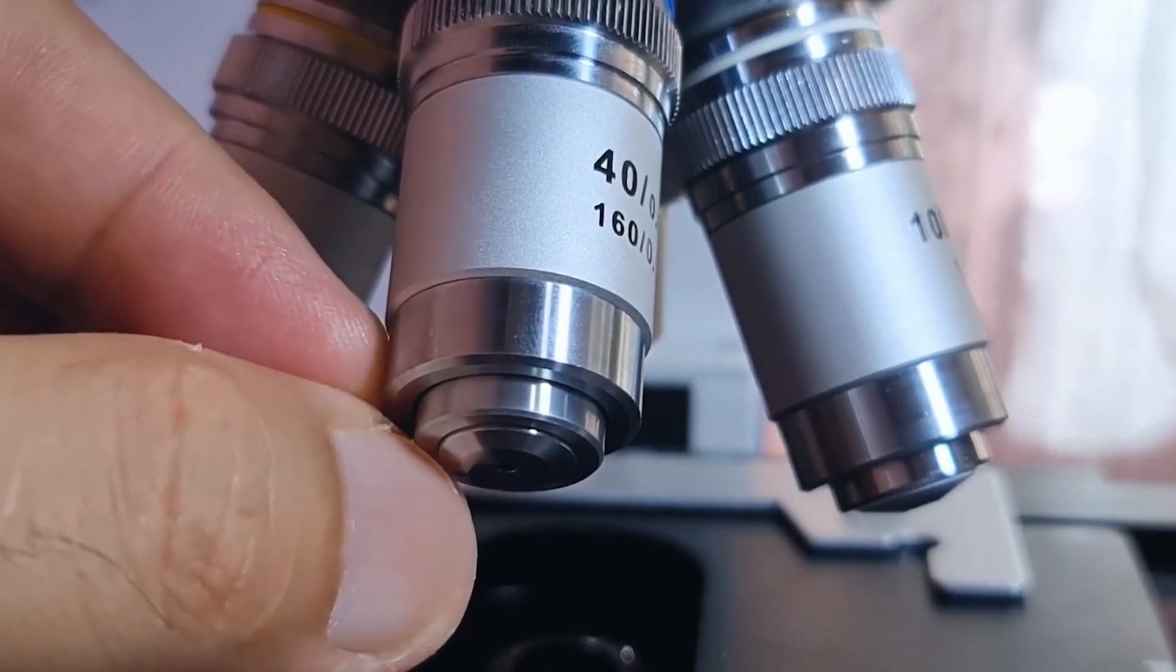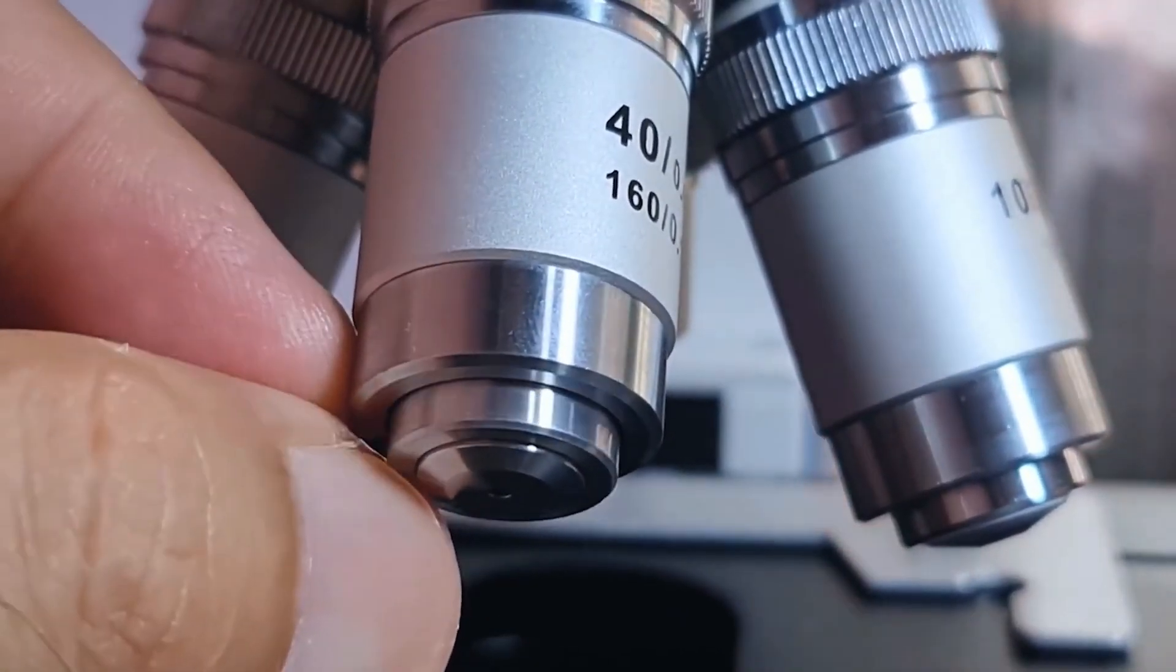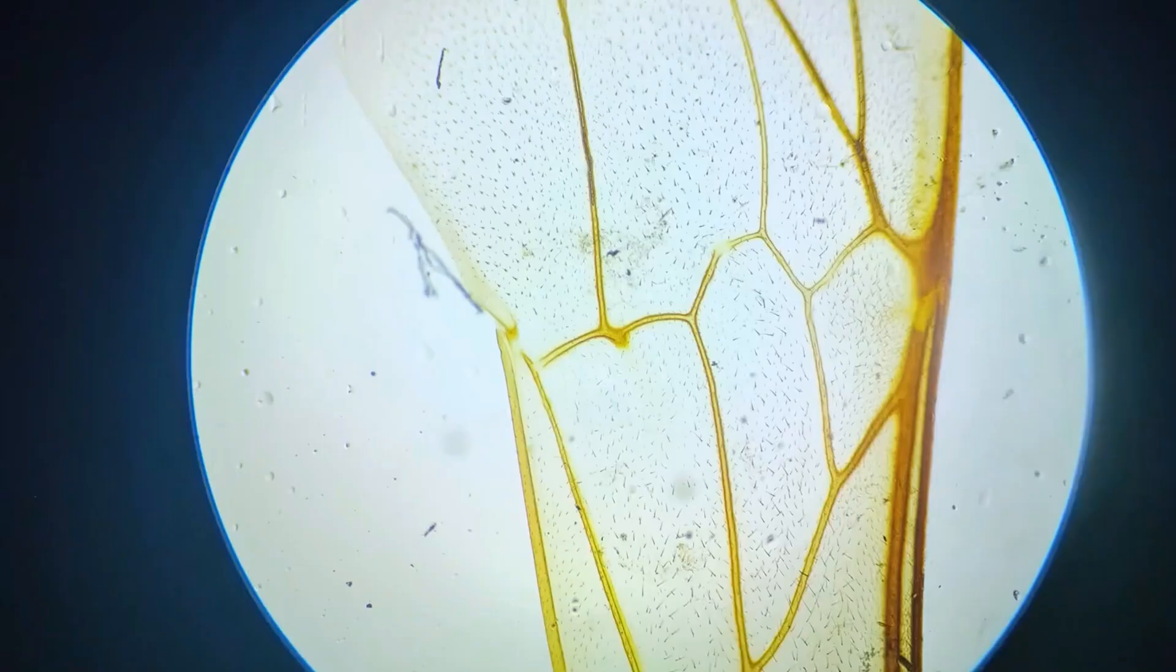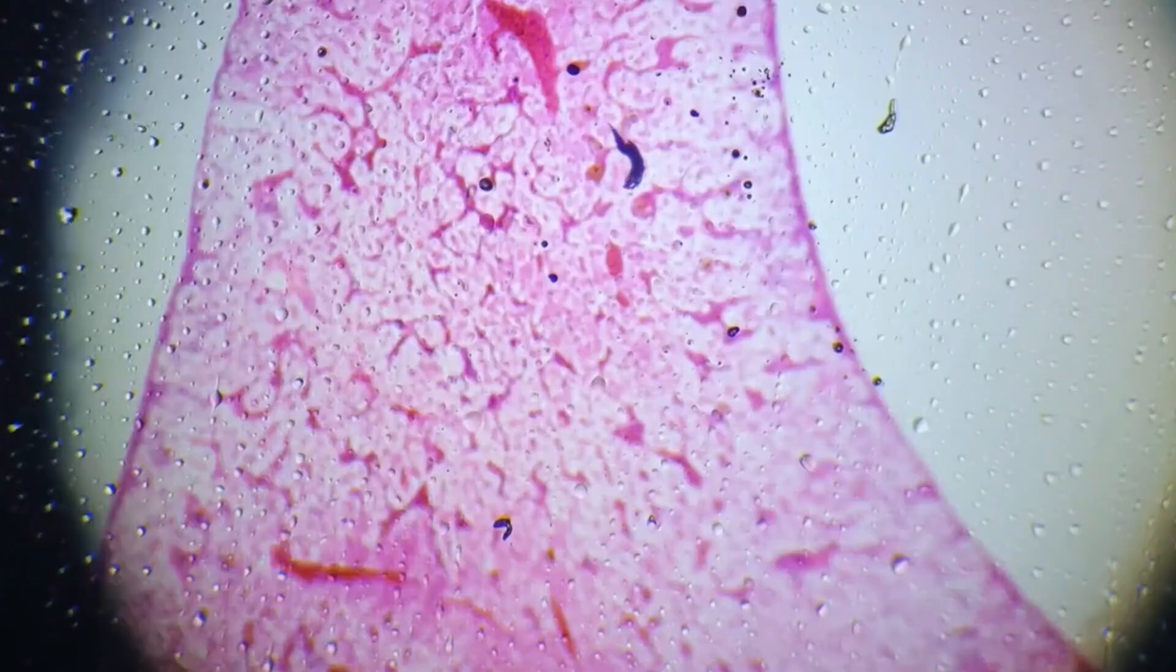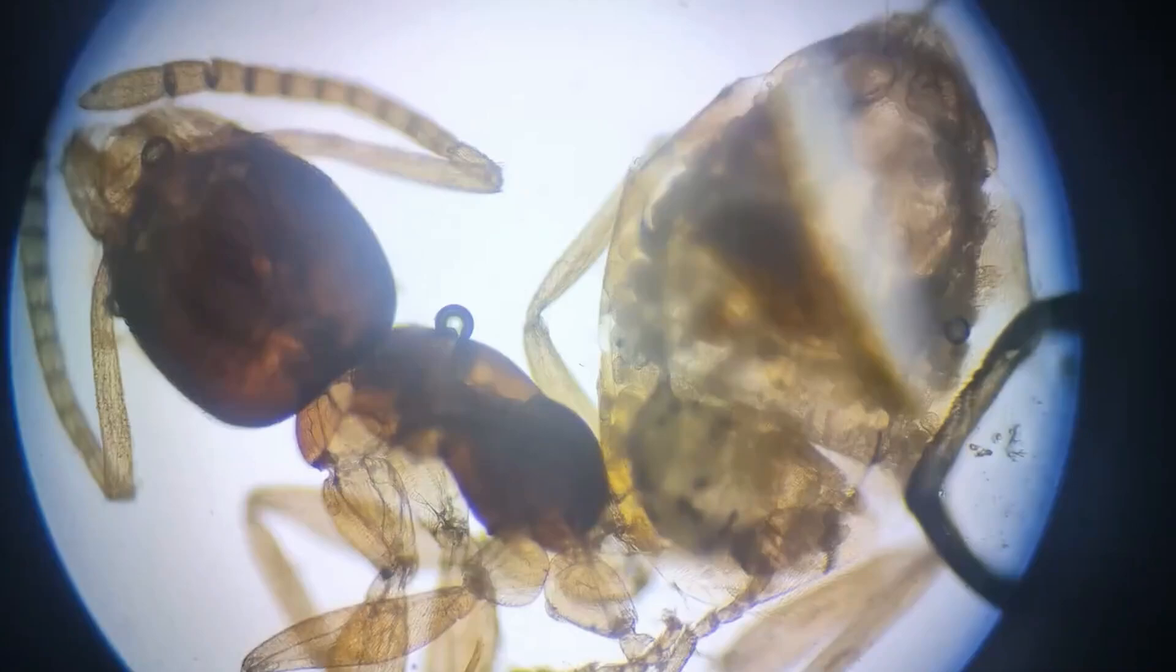For optimal clarity and light control, the microscope is equipped with brightfield LED illumination and a 1.25 NA Abbe condenser, complete with an iris diaphragm. This setup guarantees clear examinations, allowing you to focus on the details that matter most.